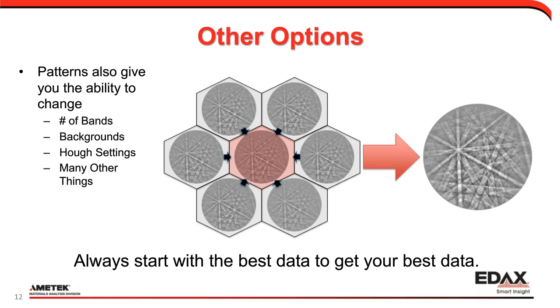Because you don't need to use these tools on perfect samples, right? If everything is perfect, with beautiful patterns and no orientation effects and all these kinds of things, the initial indexing does very, very well.